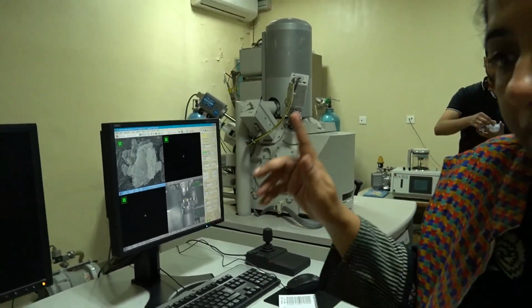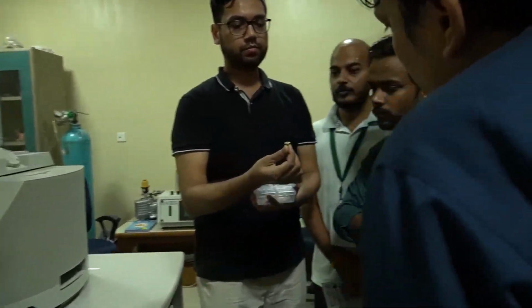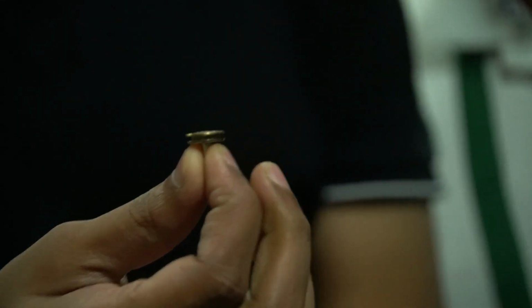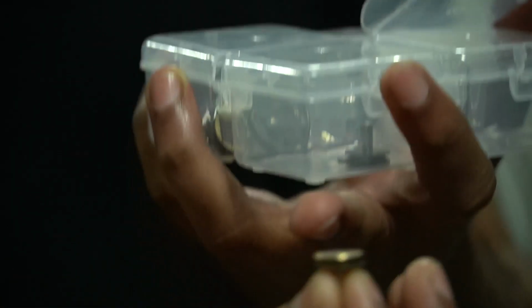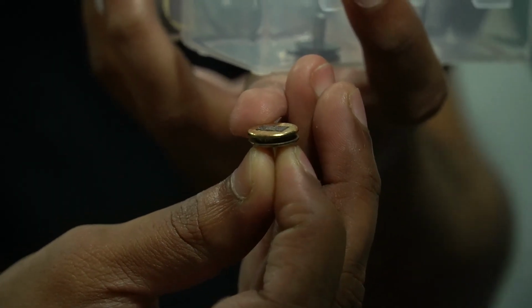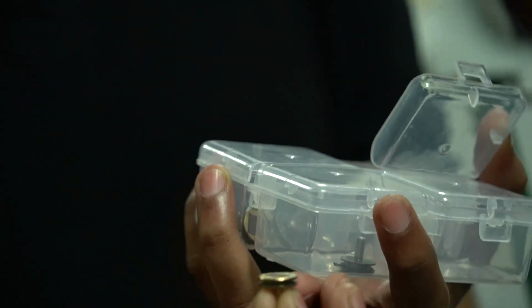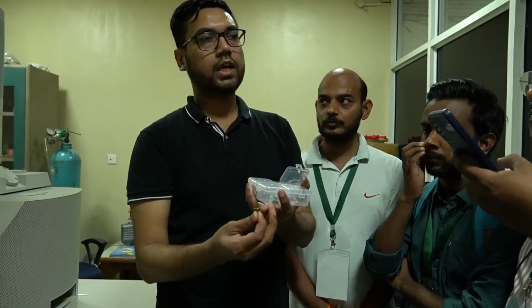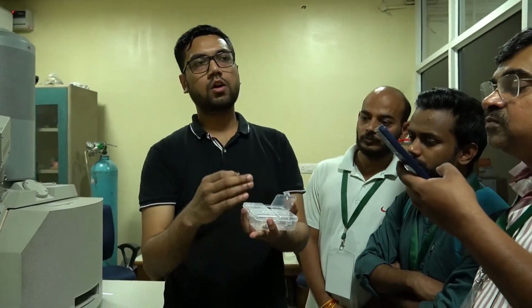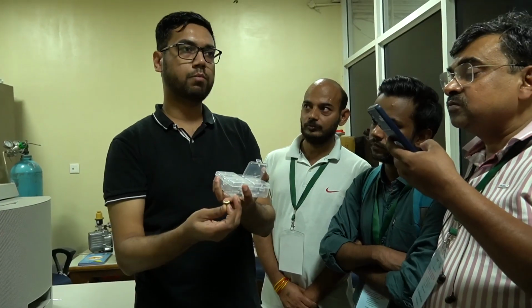In order to analyze the samples, we have a special kind of small specimen holder. It's called a stub. The sample is deposited on that stub. Here you can see the black thing is called carbon tape, because electrons are charged particles, so we have to provide them a conductive path. It is also conducting; it is made of tungsten or some kind of material. Carbon is almost like a conducting layer, and over that the sample is deposited.